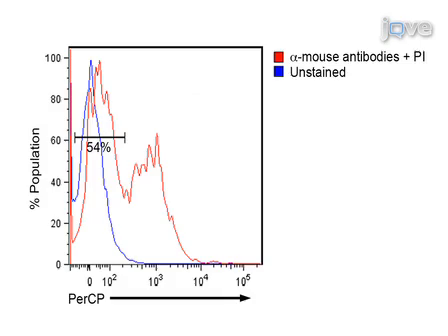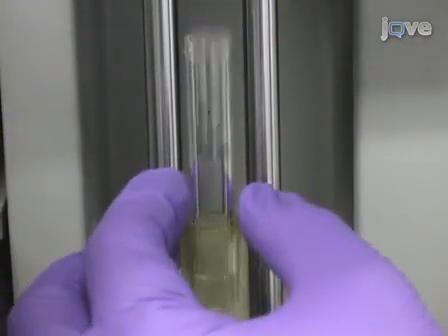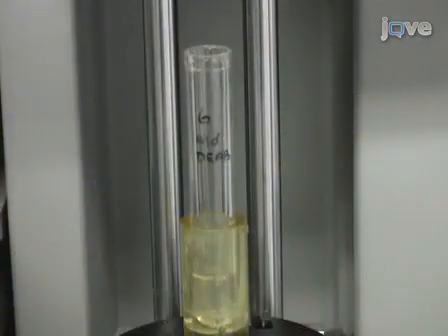Most human pancreatic cancer xenografts contain 20 to 60% mouse-derived cells using the mouse CD31, mouse lineage cocktail, and mouse H2Kd biotin conjugated antibodies. Using the DEAB treated cells, generate gates in the FL1 channel for ALDH positive cells.